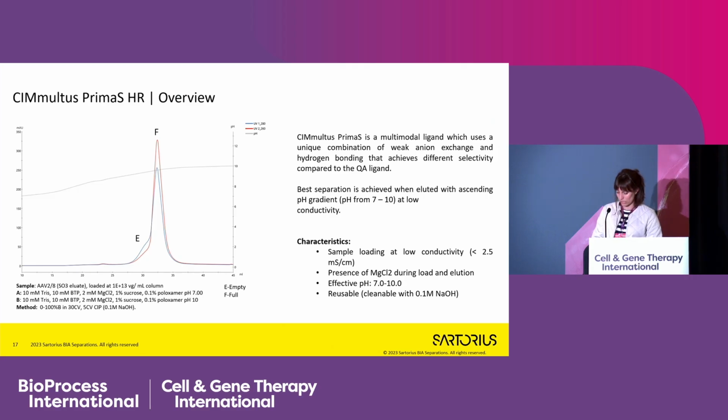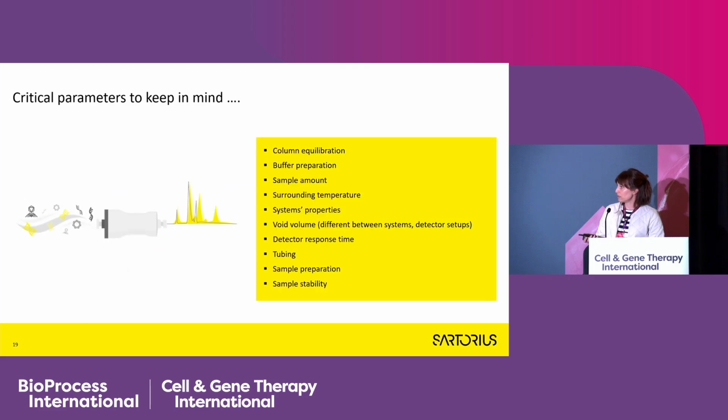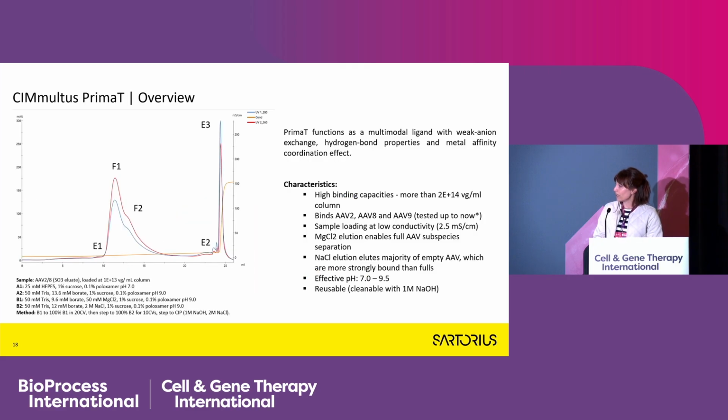You can see also that separation of empty-full here is slightly different, really, because there's a different selectivity compared to the previous ligand. And if we move on, the third option is the most complex one, so it's called PRIMA-T.